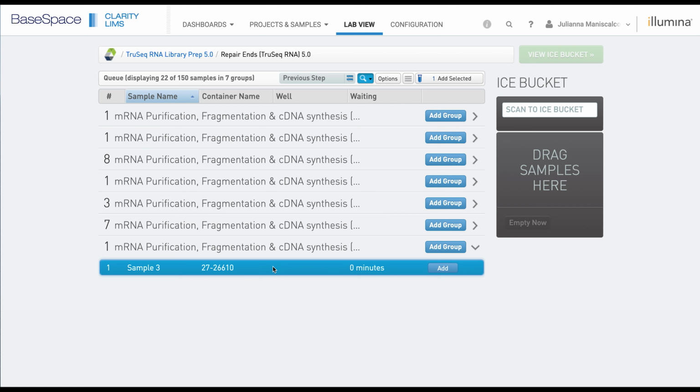These are just 3 of the options you have for the unhappy path, but it will make the system more realistic to how you're processing your samples in the wet lab.